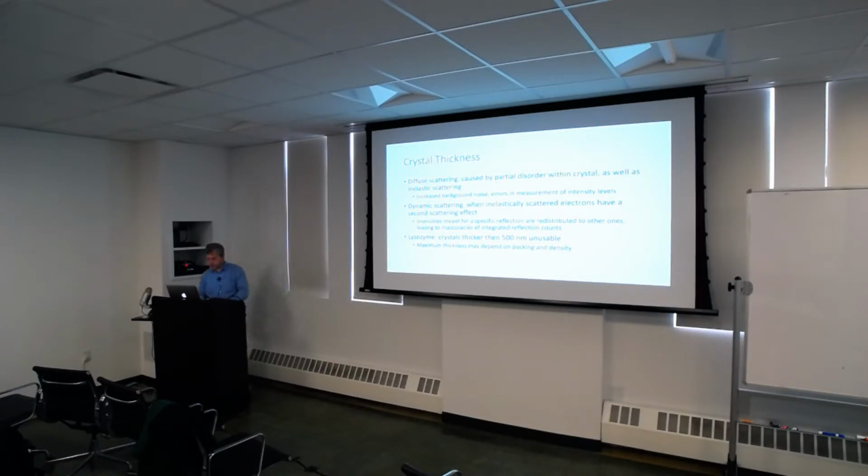Getting to crystal thickness, yeah. You can get diffuse scattering in case the crystal is distorted, or you get inelastic scattering. The thicker the crystal is, the worse the inelastic scattering is going to be. If you have a scope with an energy filter, that could help mitigate it. And also if you did it at a higher voltage, that could help mitigate it. But still, you're going to be limited by inelastic scattering.